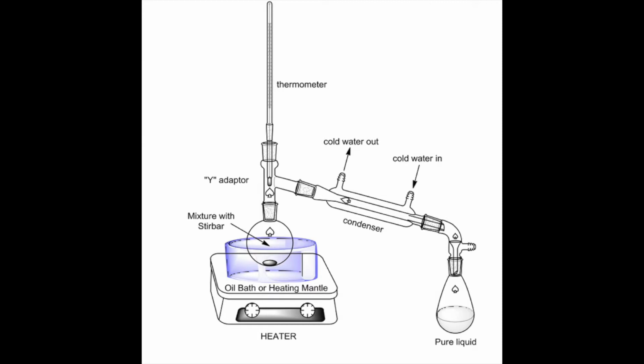Steam distillation is a technique used to distill immiscible liquids, or liquids that are not mixable and not soluble in each other. In this technique, the steam provides one of the immiscible phases and the spice is the second. The two substances mix in the gas phase and co-distill. But when cooled, the desired components separate from the water as they are immiscible.